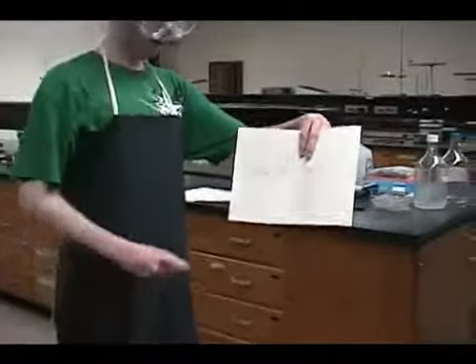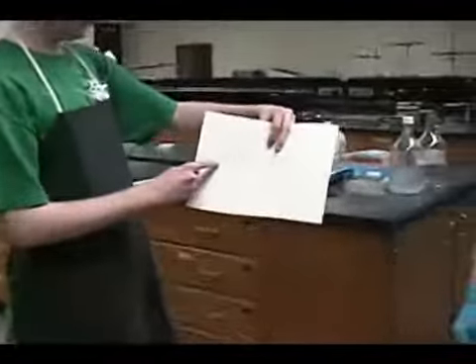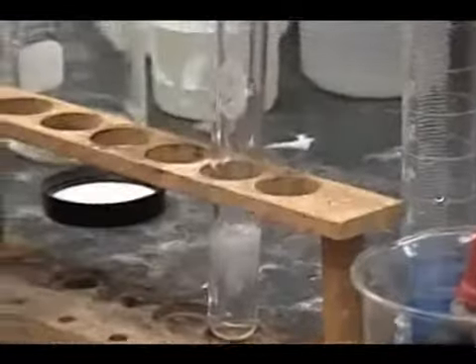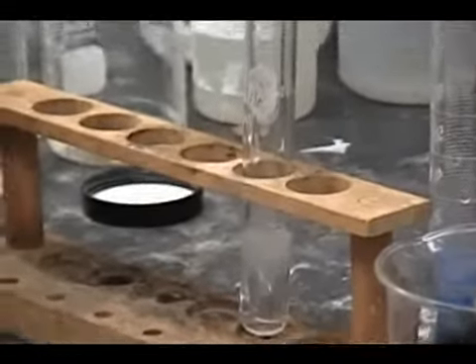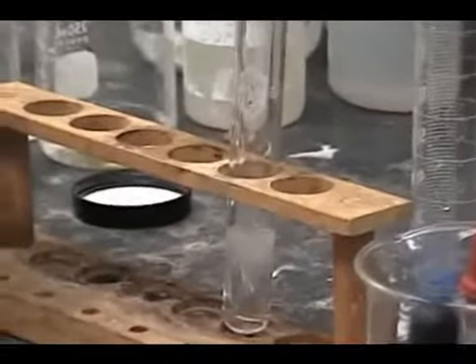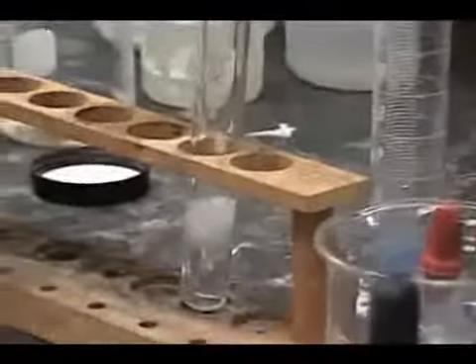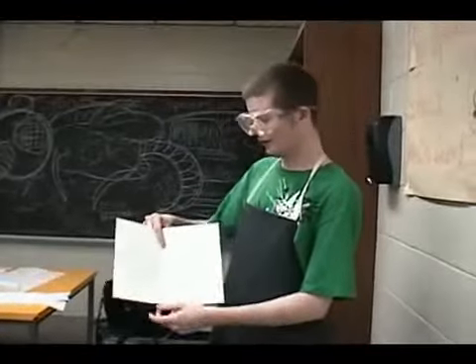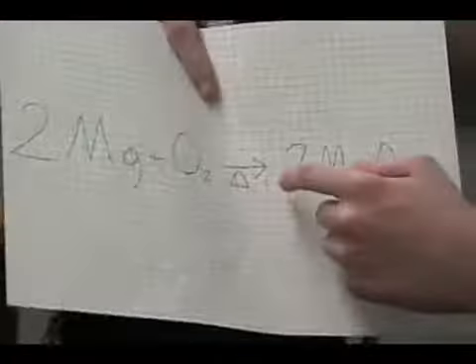The reaction we'll be doing today is sulfuric acid with potassium hydroxide to produce water and potassium sulfate. Okay. Get closer. Get closer. Do another, just do a little bit more. You got it? This reaction will have magnesium and oxygen with addition of heat to produce magnesium oxide.